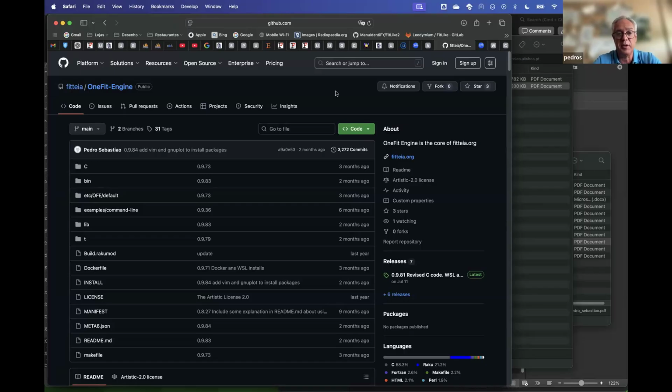Of course, there is always the possibility that you are interested in developing a full graphical interface to benefit from the full features. I think Eduardo is introducing some features at the beginning just for the magnetization decay, but he's aiming as well to fit the dispersion profiles.